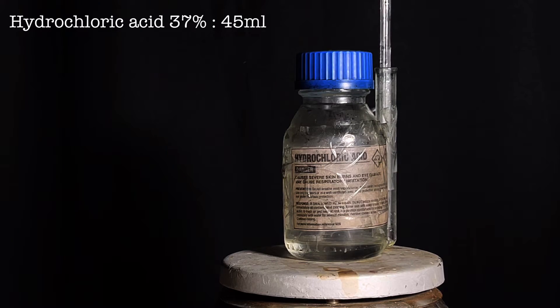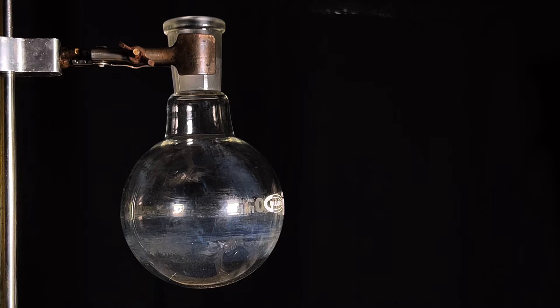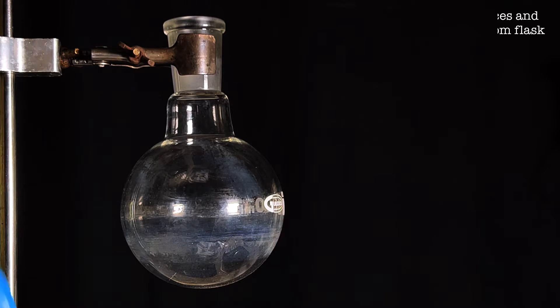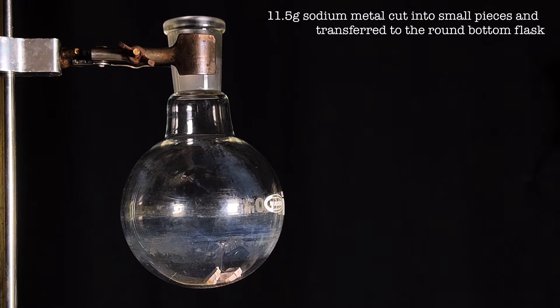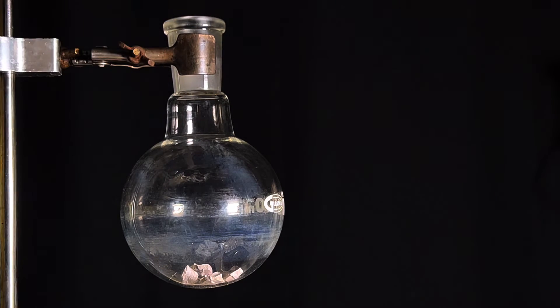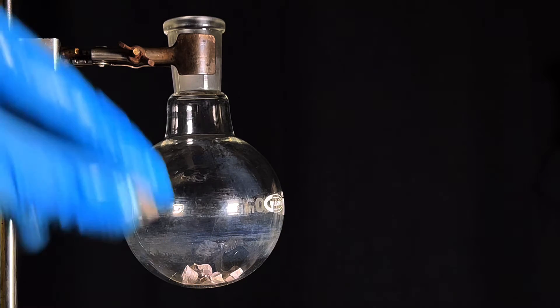A 500 milliliter round bottom flask is fixed onto an iron stand using a clamp. Sodium metal pieces are cleaned and dried from mineral oil, cut into small pieces, and 11.5 grams was transferred to the dry flask.